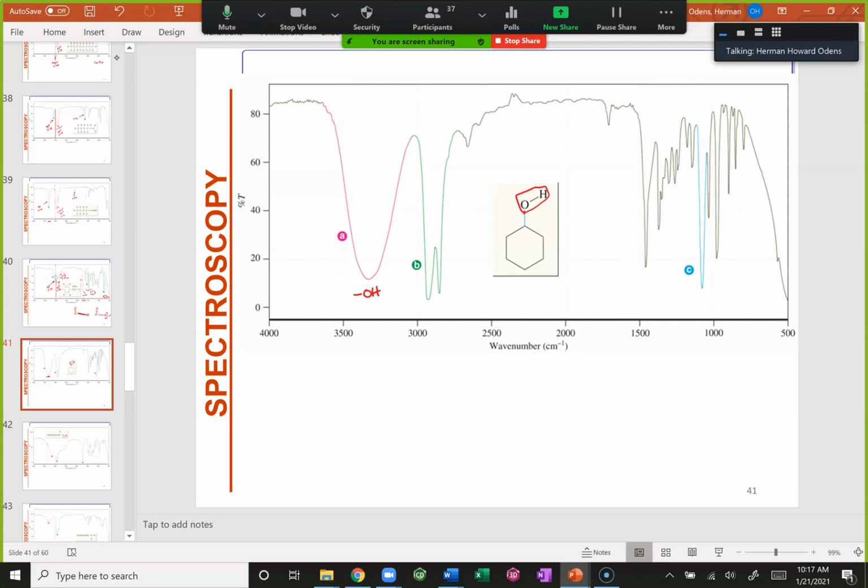I'm going to keep on tracing my magic line. So magic lines, I don't have anything on the left side. There are no peaks here. So therefore, I don't have sp2 character, but all these guys will be sp3 CHs.